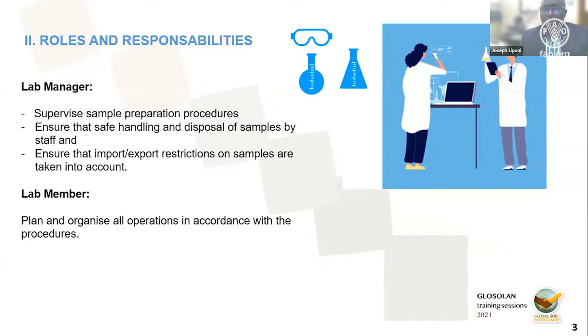Whoever the lab member is who is responsible for actually carrying out the sample preparation, it is very, very important that he should be adequately trained and he should be able to plan and organize all operations in accordance with the procedure, without taking shortcuts or modifying things that have not been authorized.